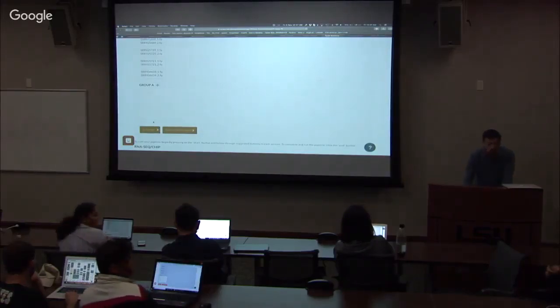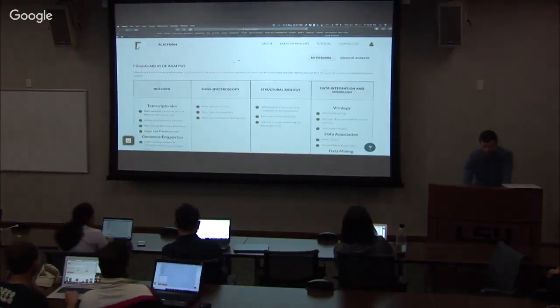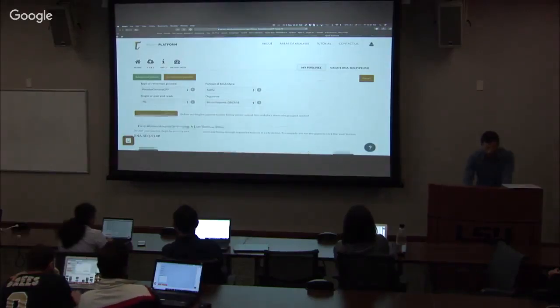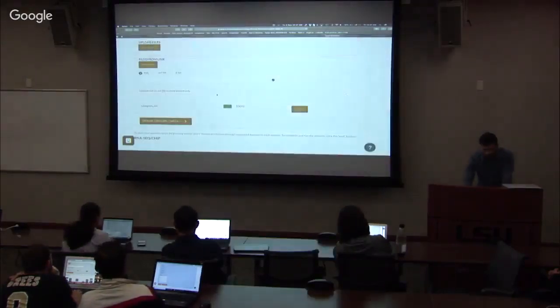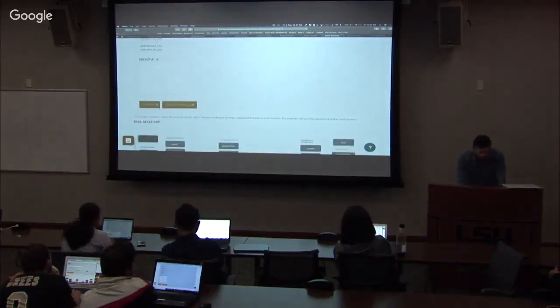What start page are you on from the main menu? I am under RNA Seq. So if I go to areas of analysis, it's this first one. So I go here, upload files and add groups, URL bulk upload, samples.svl, define groups check. I can just do cancel.